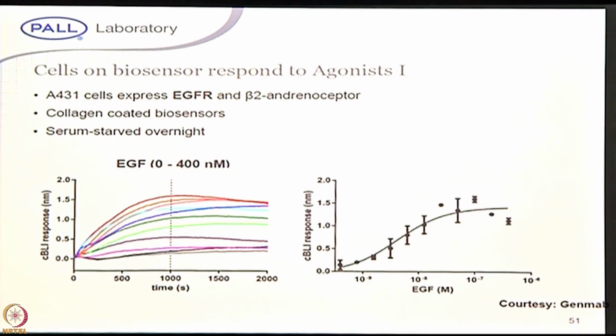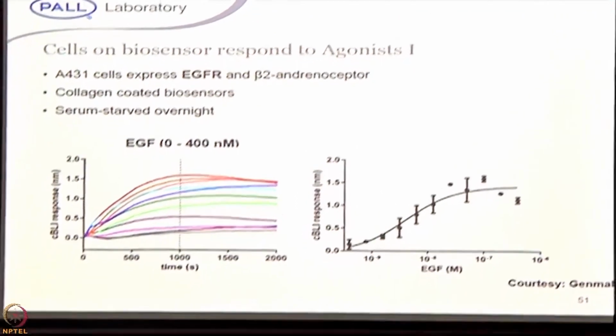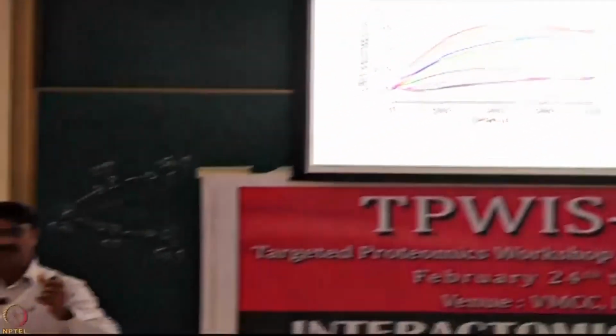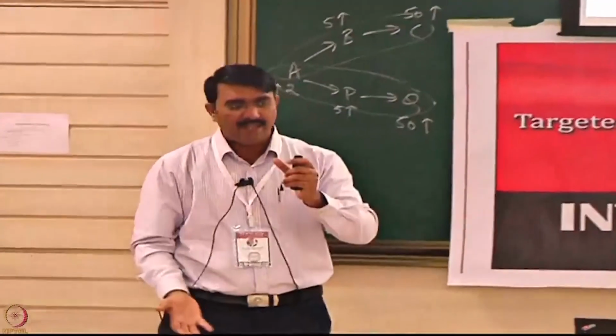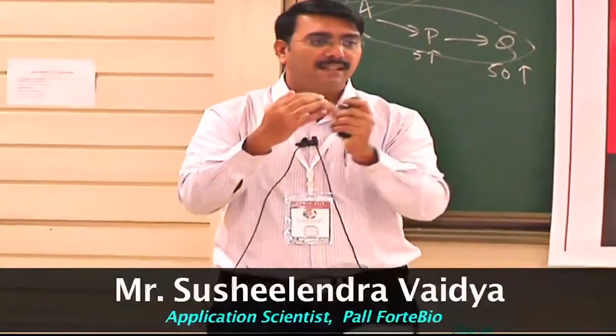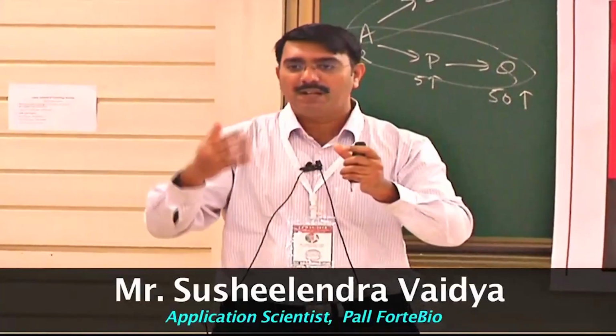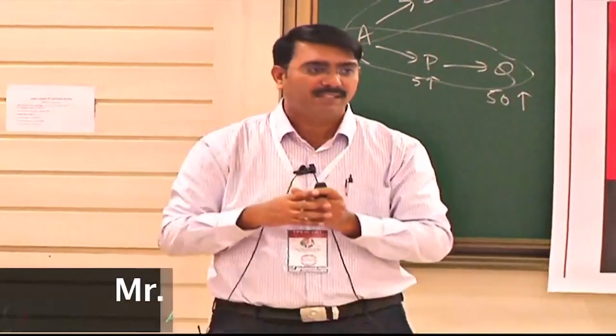It is not exactly kinetics; it is orthogonal to your cell-based assays. Suppose you are immobilizing a big cell on the sensor surface, and then some tiny protein binds to it. You can't see a biolayer change on the sensor surface. But when molecules bind to the respective target on the cell surface, there are events happening in the cell, such as actin modulation or other pathways.